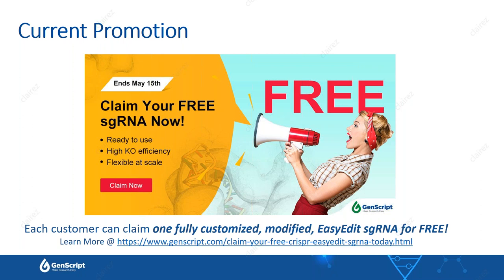The next one is, what is the best method to detect off-target in cells or animals? Yeah, that is very tricky. There is software which can tell you predicted off-target effects, where you would anticipate off-target, so you can go in and sequence those. The other method is of course NGS. That is an area where I think the field definitely needs to agree upon a method in order to detect off-target effects.